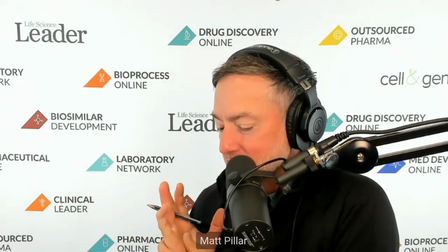Polling question number 3 on this topic of sensors. Which advanced sensors are you interested in for process control? Viable biomass, Raman spectroscopy. Having trouble with my words today. Glucose, lactate, foam, off gas, at-line HPLC, or other.